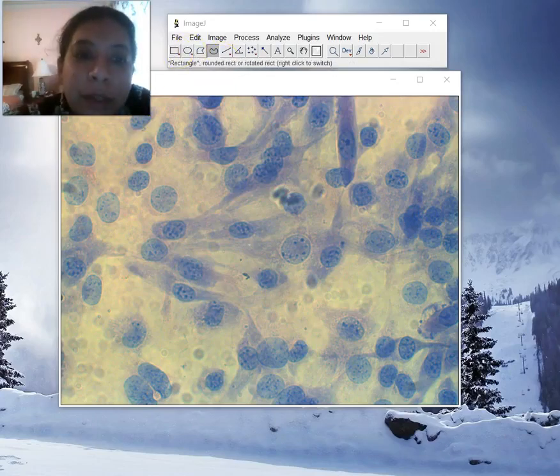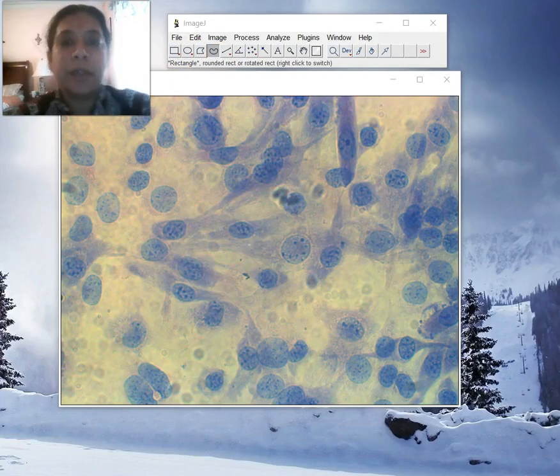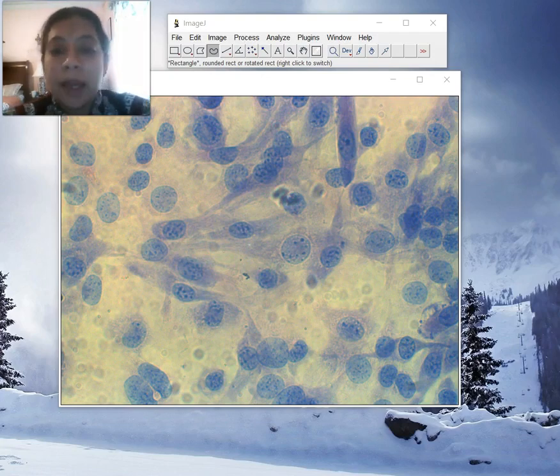So today we are going to look at ImageJ software to examine how we can use it to identify different morphologies of cells using the capabilities present within this system. We are going to do two things. First, we are going to learn how to identify the different morphologies, and then we are going to go back and count the number of cells in each one of those morphologies.